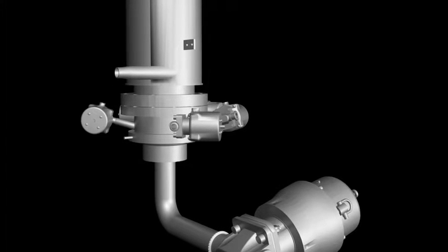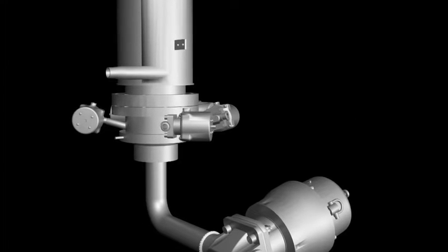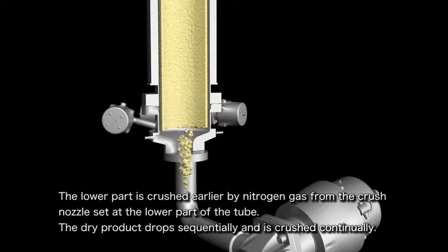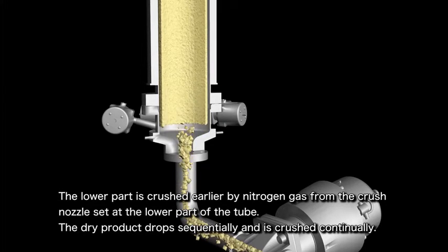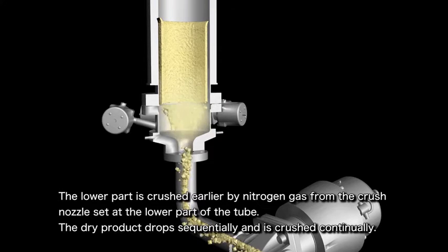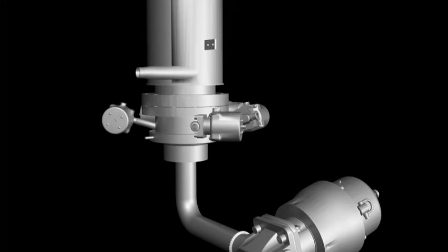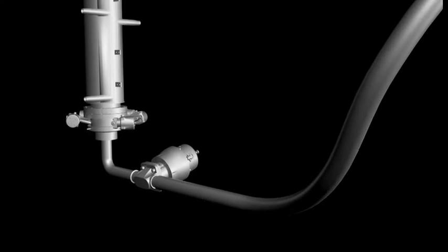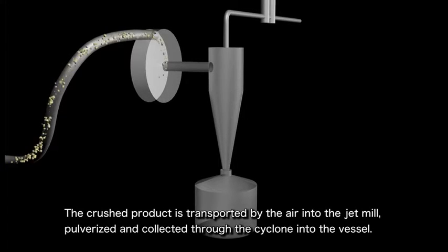This is the final part of our explanation, which addresses the process of crushing the dried products. After releasing decompression, nitrogen gas is blown through the crushed nozzle attached at the bottom of the tube. The gas crushes the dried product starting from the lower end of the tube and blows it into the jet mill. The crushed products are then pulverized by the jet mill before being recovered by a cyclone.